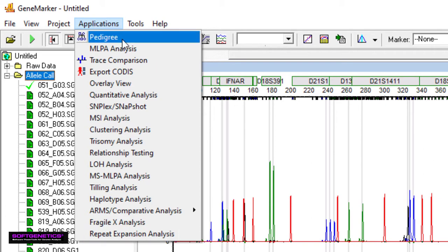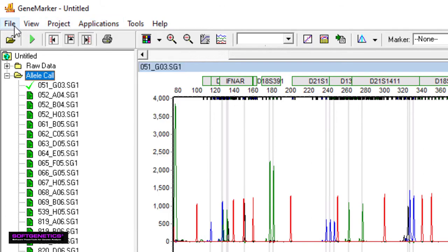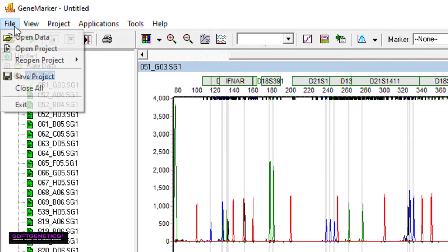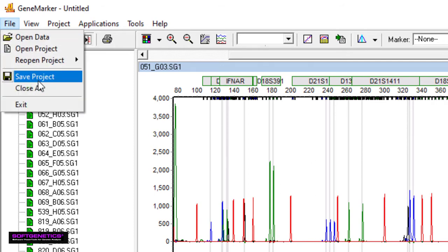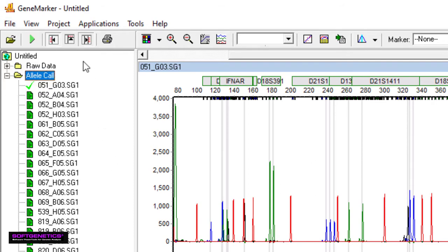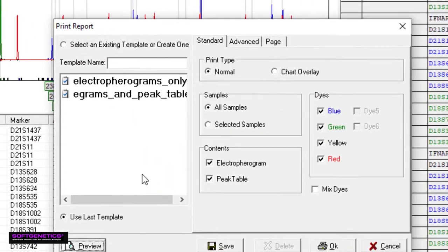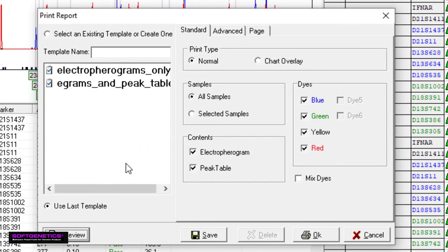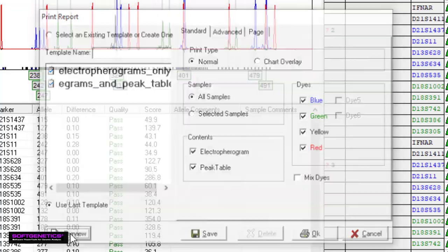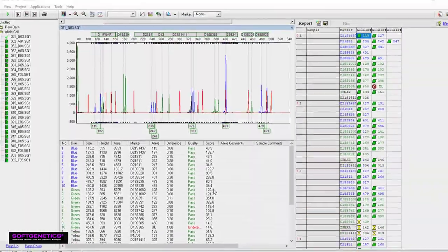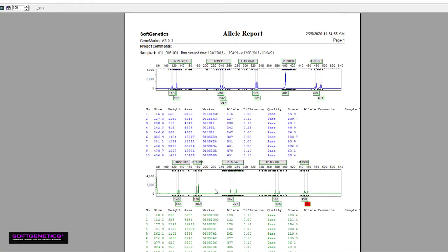Each application is the subject of a future webinar. The project can also be saved and opened later, or an allele report can be printed. To do this, simply click the printer icon. There are many options that allow you to modify the report to your liking. When ready, view the report by clicking Preview. These reports can be printed or saved as PNG, JPEG, or PDF files.